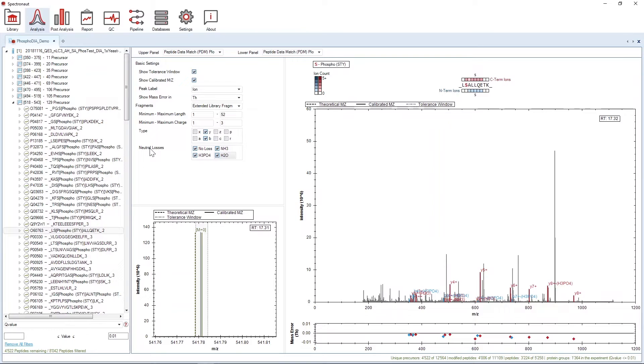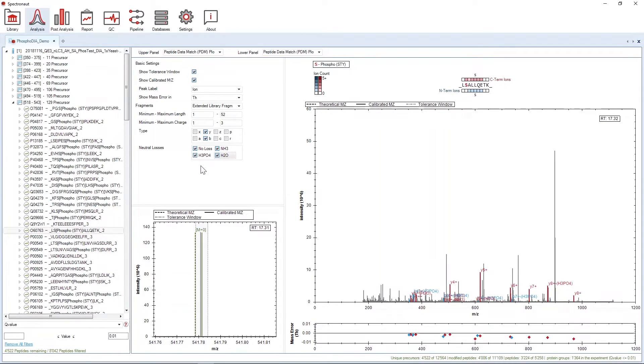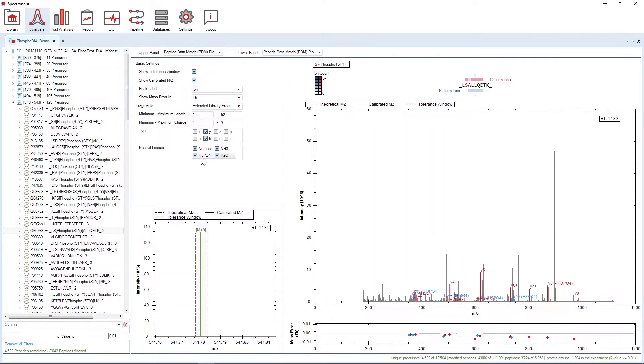And finally, there's the neutral losses. If you have a dataset with modification-specific neutral losses, for example a phospho dataset like we have here, then those losses will be automatically added to the selection.